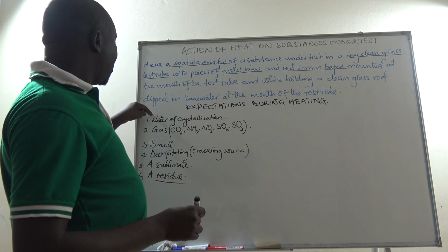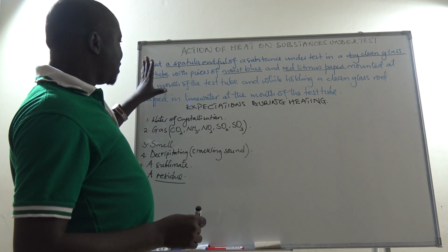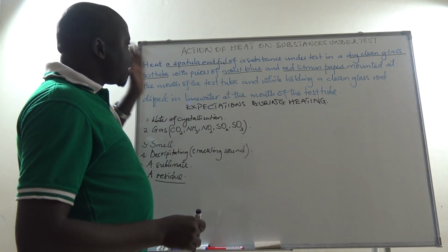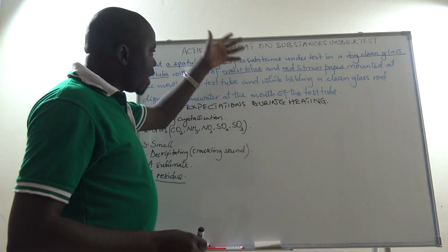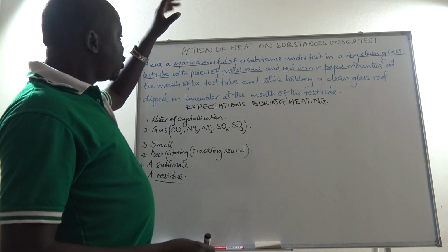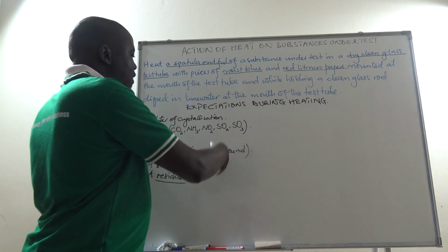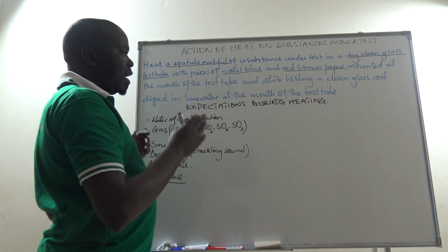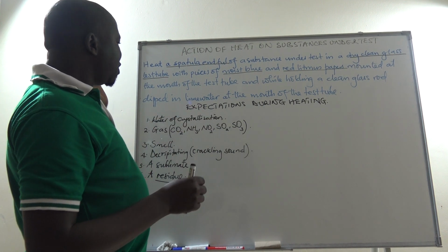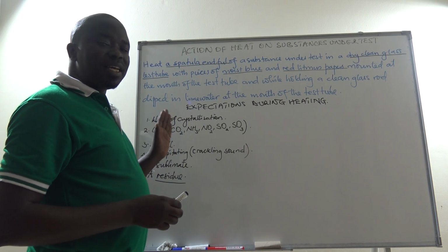So we are going to have a look at all these one by one. And this is generally an overview of what we expect to do when we are preparing for heating, what we should do when heating, and the expectations that we have when we are heating. So we shall look at all these, the possible observations that we can make during heating in qualitative analysis.